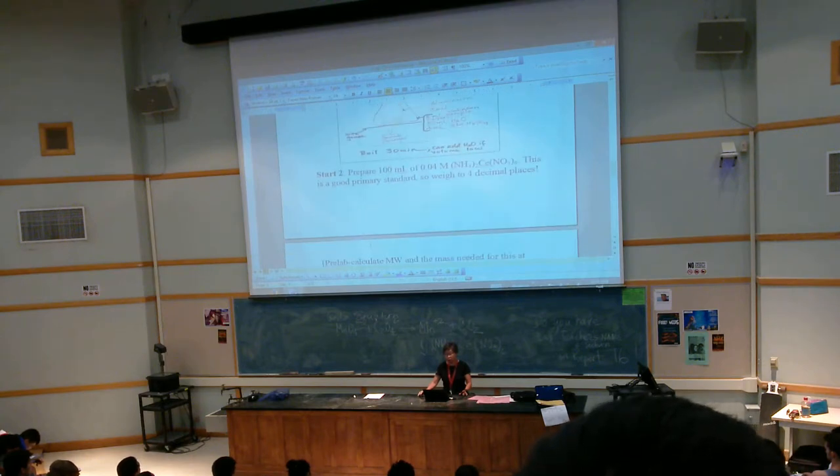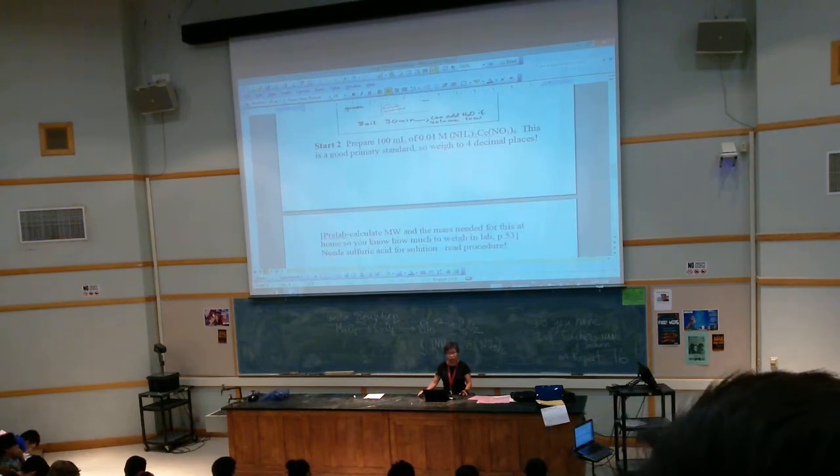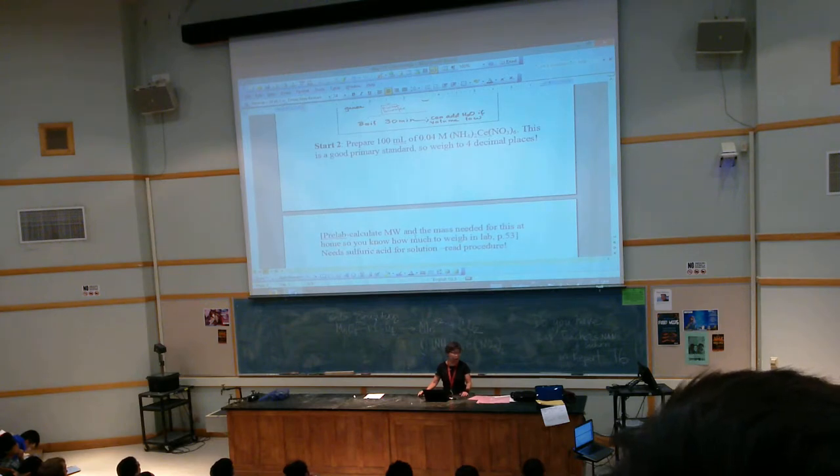But before you do that, pre-lab is required for you. Calculate the molecular weight, and you guys have Google, right? Find a good source for it. If you don't want to calculate, that's good practice where you calculate molar mass, right? And the mass needed, knowing this, can you find how many moles this requires? Can you find the number of grams you need to weigh?